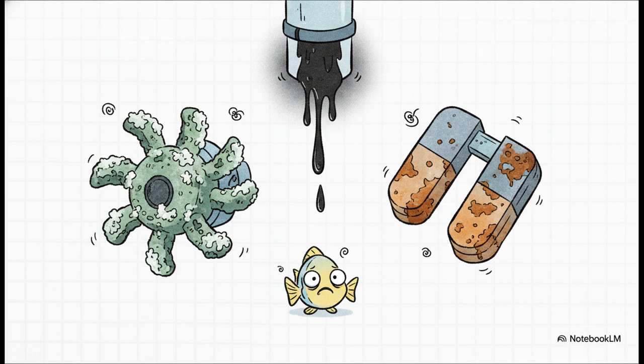Then you have tin and zinc. These frequently leach into the water from equipment that's degrading right under your nose. We're talking corroded pump impellers, rusting magnet mounts on your glass, or degrading light fixtures. Because they break down so slowly, these lethal toxins accumulate silently over time, completely escaping the notice of standard test kits until, well, a catastrophic crash happens.